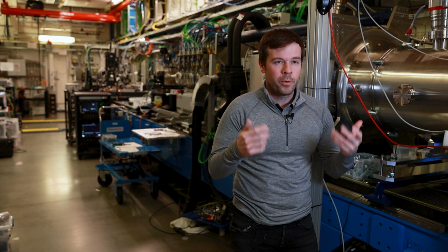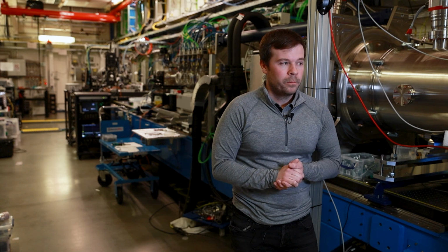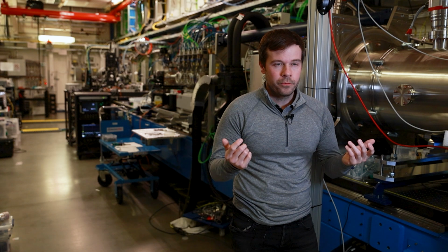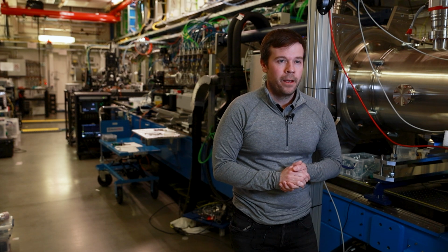So in order to do the experiment in solution, which we aim for this week, we needed to develop a different type of liquid sample injection, which is in the form of a very thin liquid jet on the order of sub 50 nanometers, which reduces this background by upwards of a factor of 50.